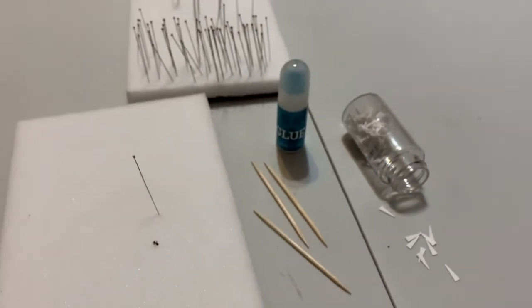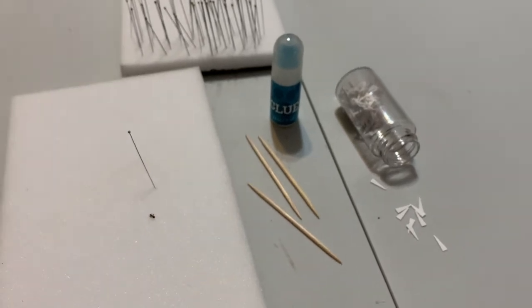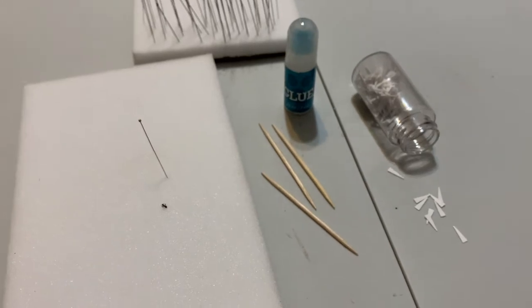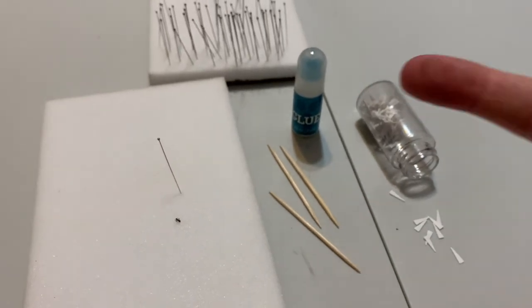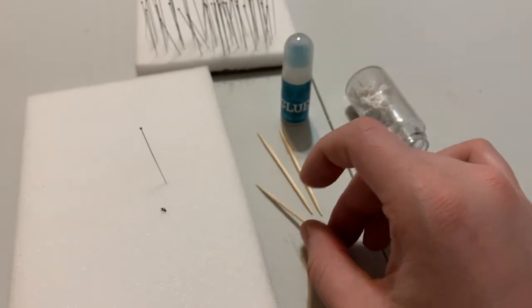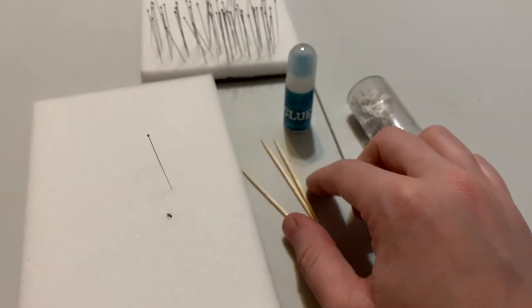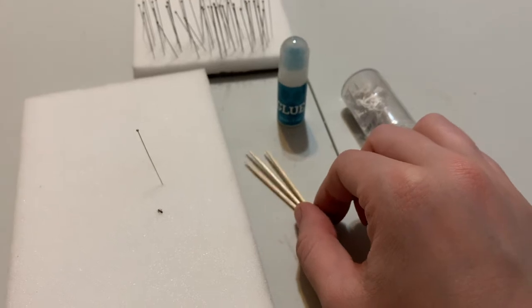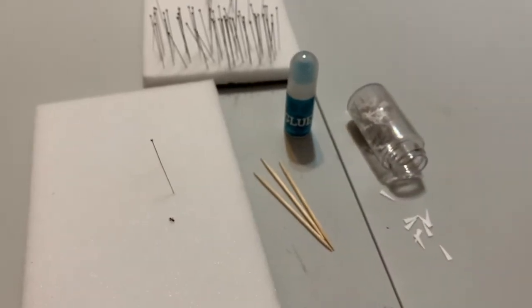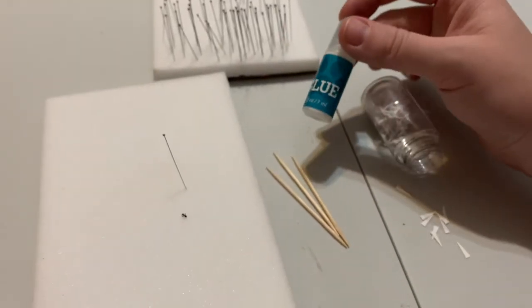Okay, so what do we need in order to point an insect? Well, of course, we need the points. You need some pins. You may want some toothpicks, although the head or the point of a pin can also serve the purpose of what I'm going to use these toothpicks for. And this is actually white school glue.